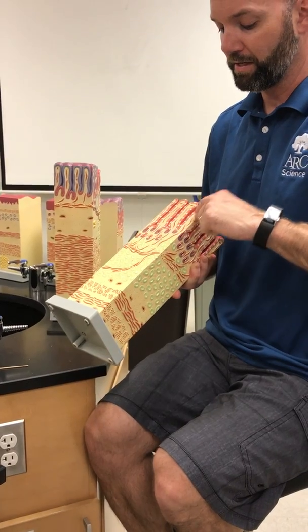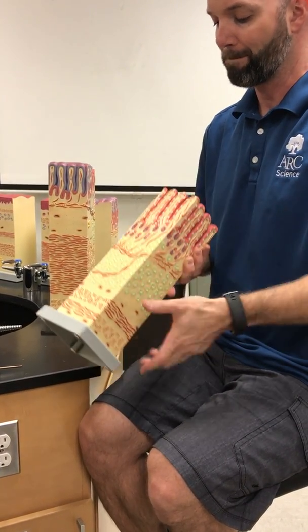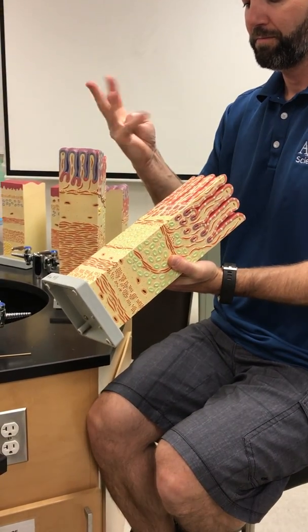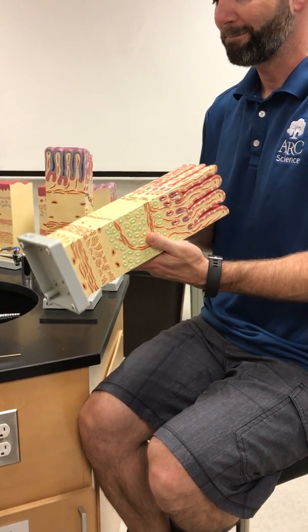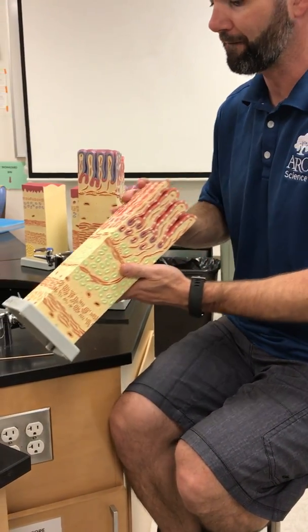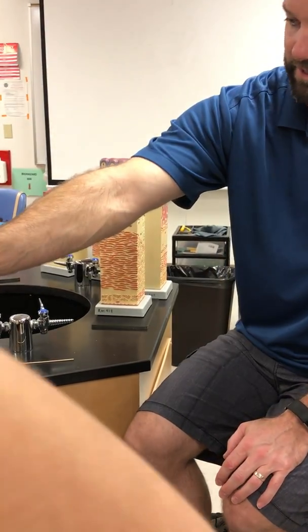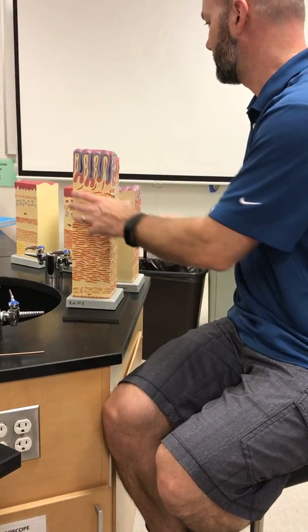What are these red streaks coming up here into the villi? Smooth muscle fibers, and what do they do? Move the villi. Make the villi wiggle all the time. What do these duodenal glands secrete? And mucus. So put it together, yes, alkaline mucus. Bicarbonate mucus.